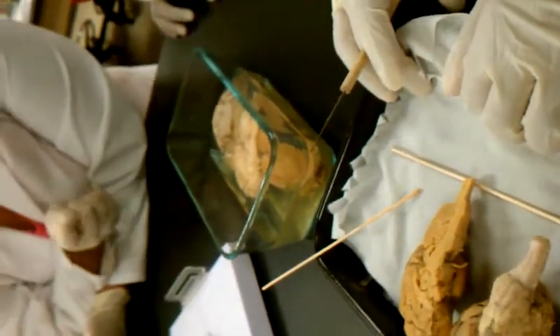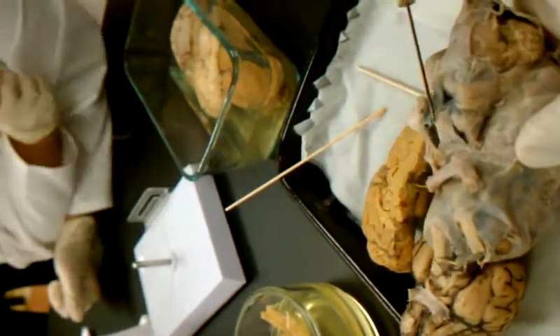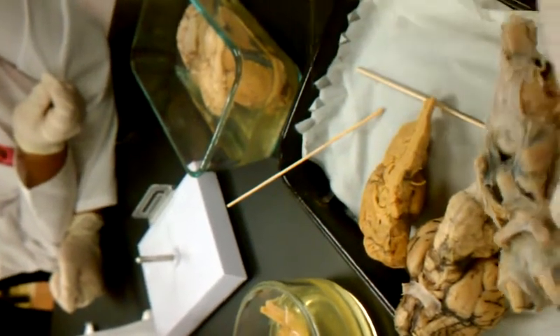Okay. And the pituitary gland. Pituitary gland is this one. Okay. So if you see the pituitary gland, name the gland in this view. If you see the hole, that's your pituitary gland.